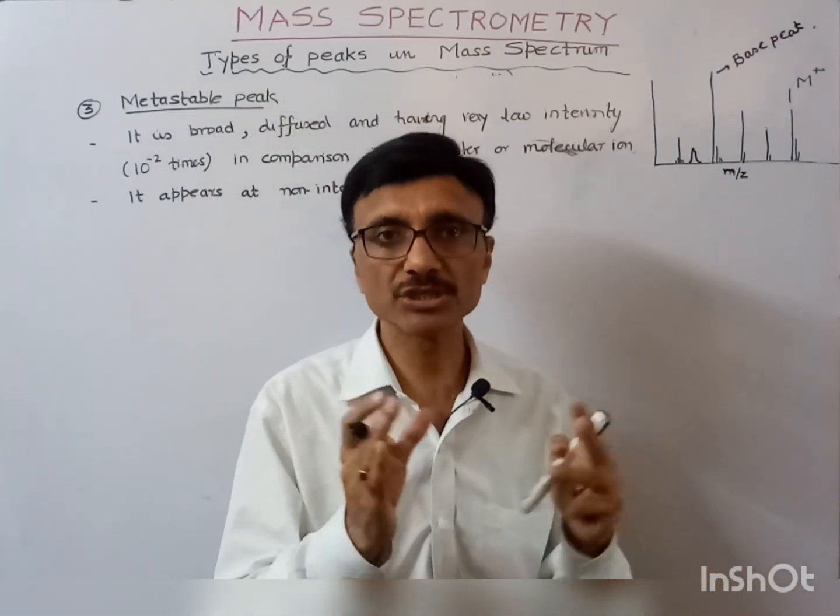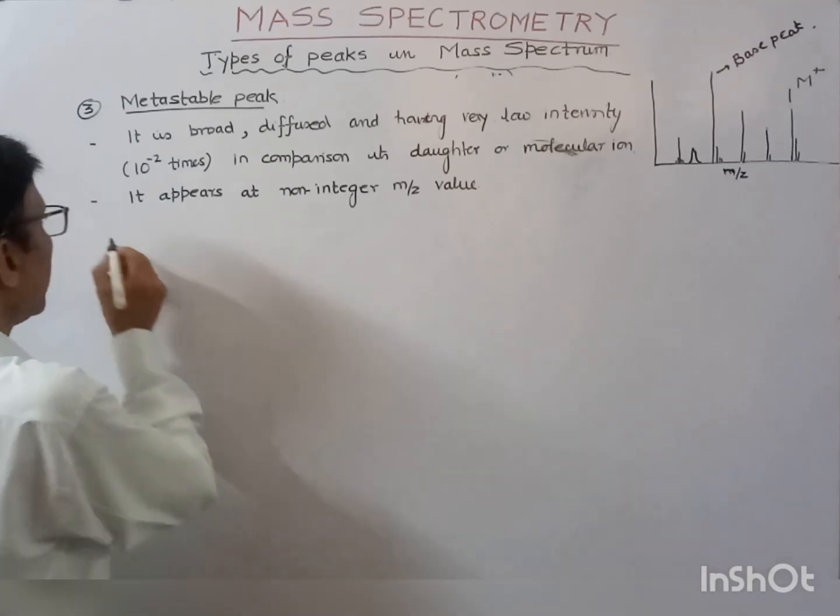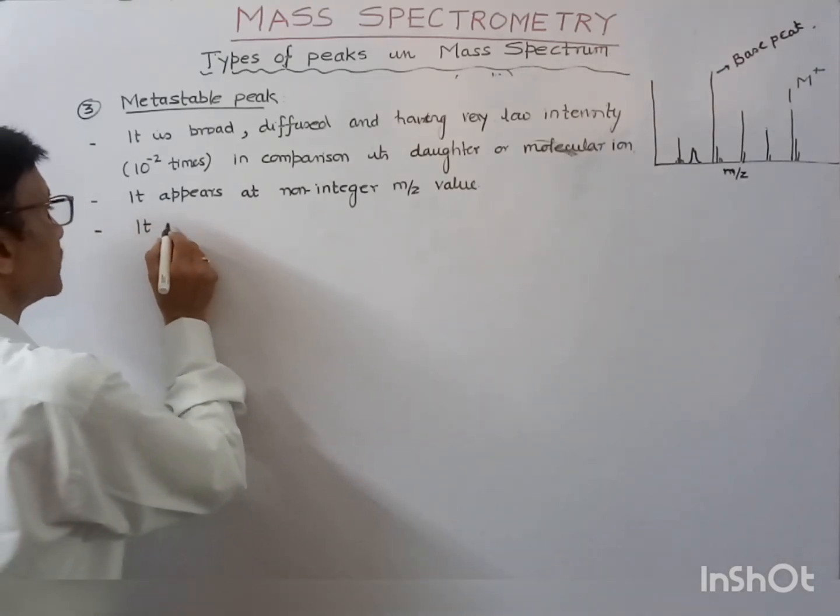So its position is non-integer, and it can easily be recognized by its shape.